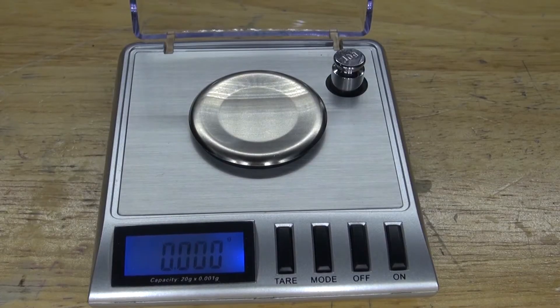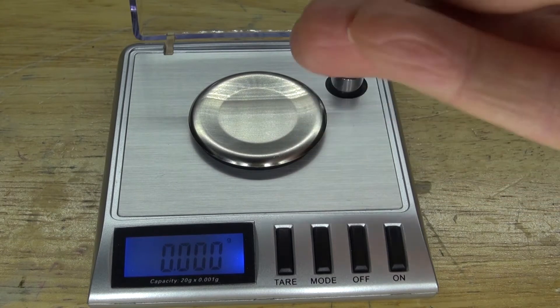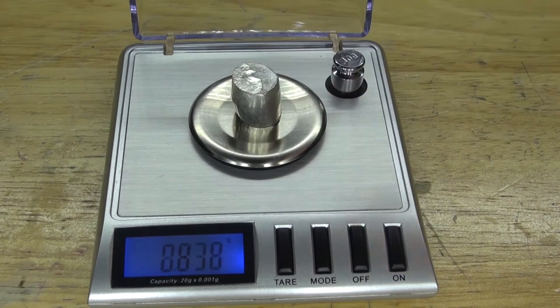I have right here a very sensitive scale, and I want to weigh out the percentage of each element, starting with tin. As you can see, 16% tin, or 16 grams of tin, which is exactly what I want.